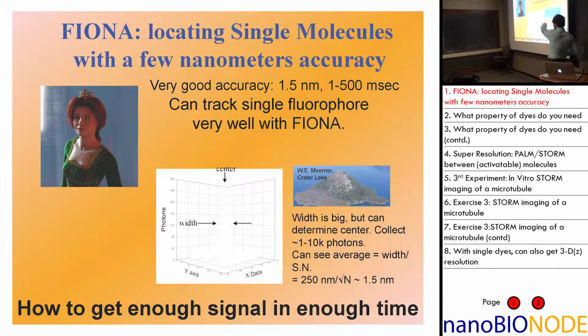Okay, so you've seen this many times. It has a width of 250 nanometers, but the center you can locate much more accurately than that. If this thing moves, as in the fluorophore is connected to a molecular motor or something, you can watch it move.